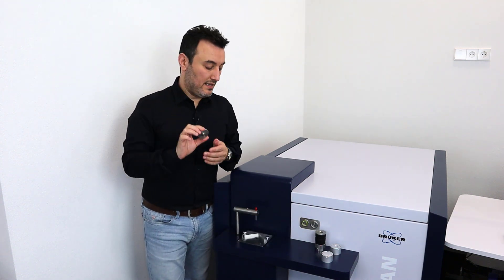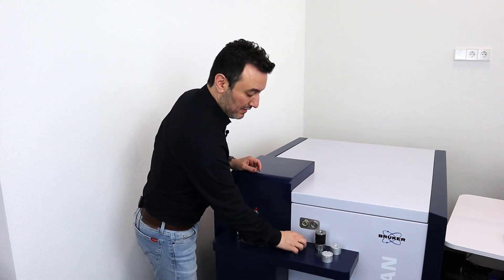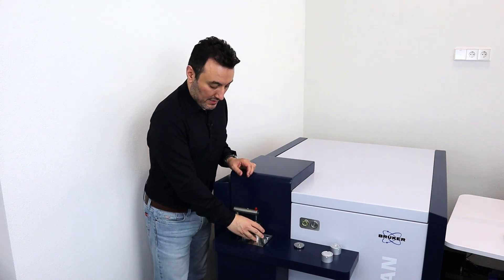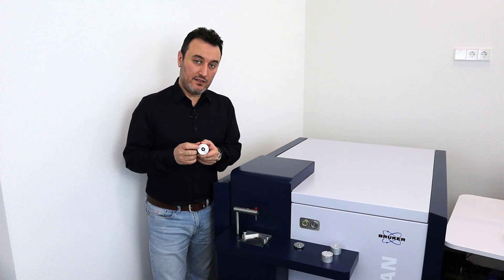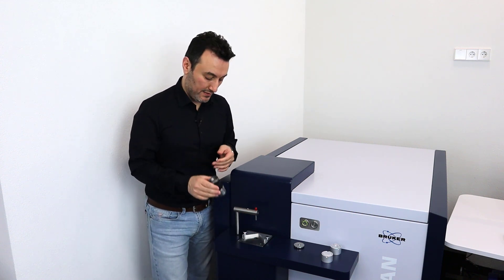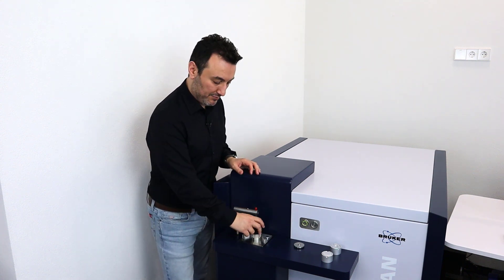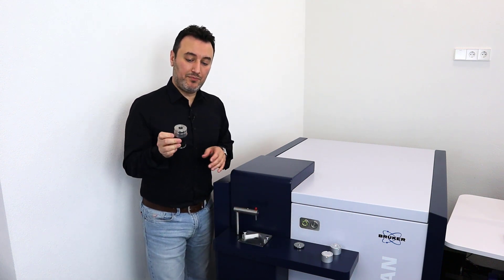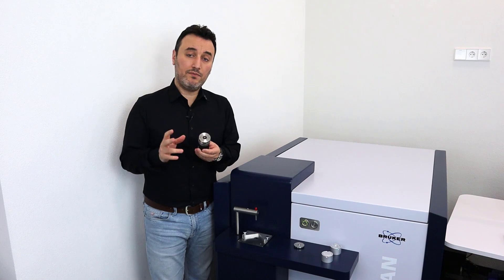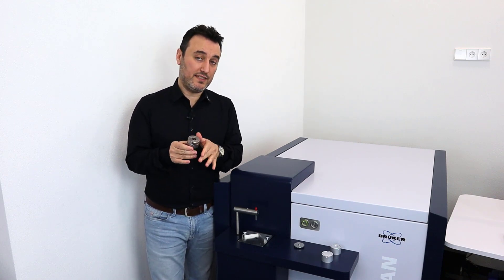Since this centering disc and all the other circular adapters have the same diameter, I place the wire adapter on the spark stand plate. Now I know that my sample in the center and the tip of my lower electrode are concentric. This is how I ensure the alignment of the sample on the spark stand plate. This sample adapter is very similar to the one we saw before, except it does not have those two pins — the surface is entirely flat.